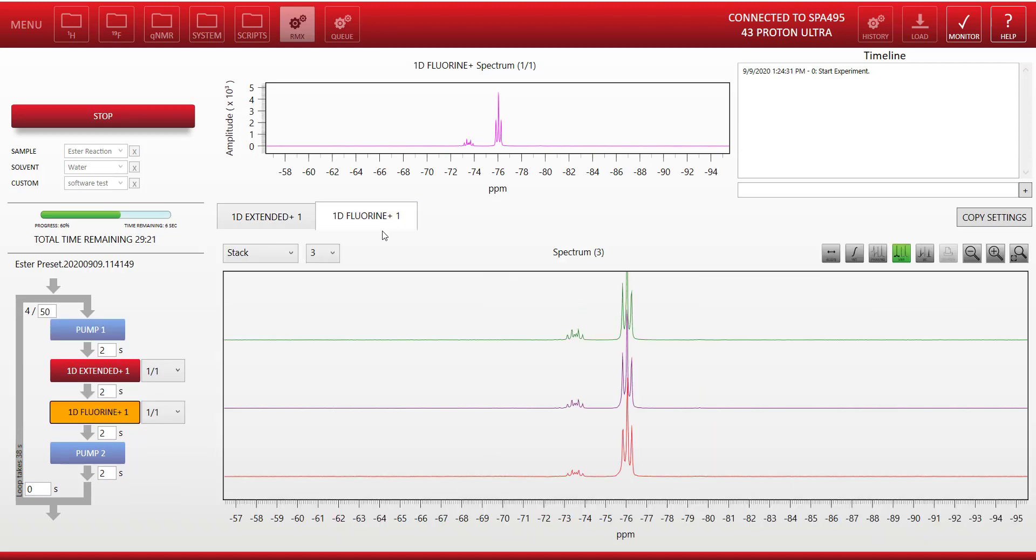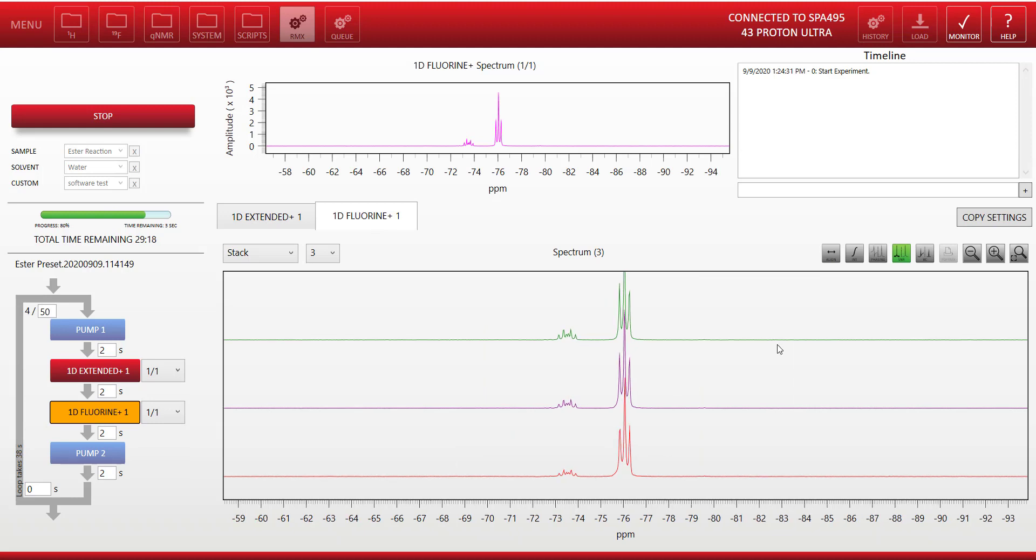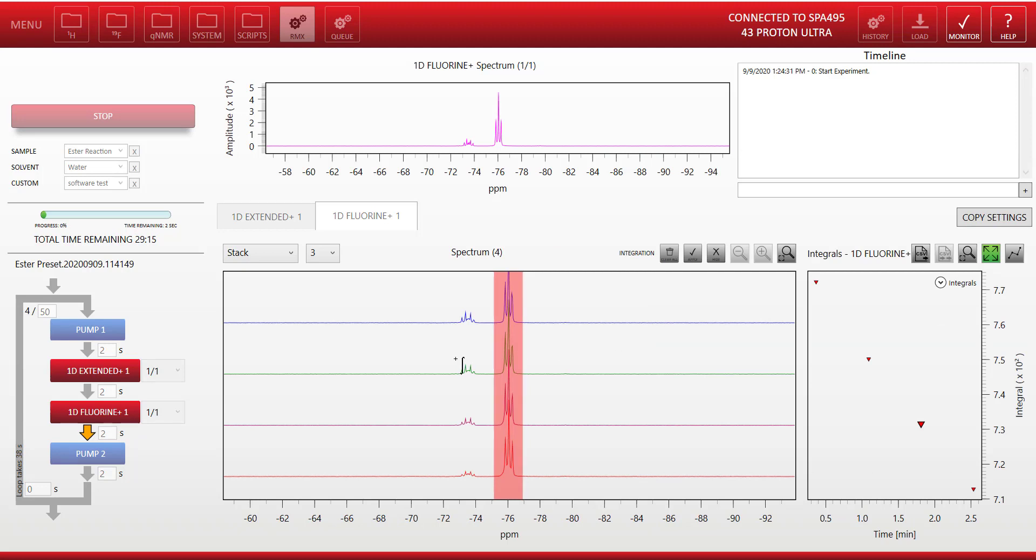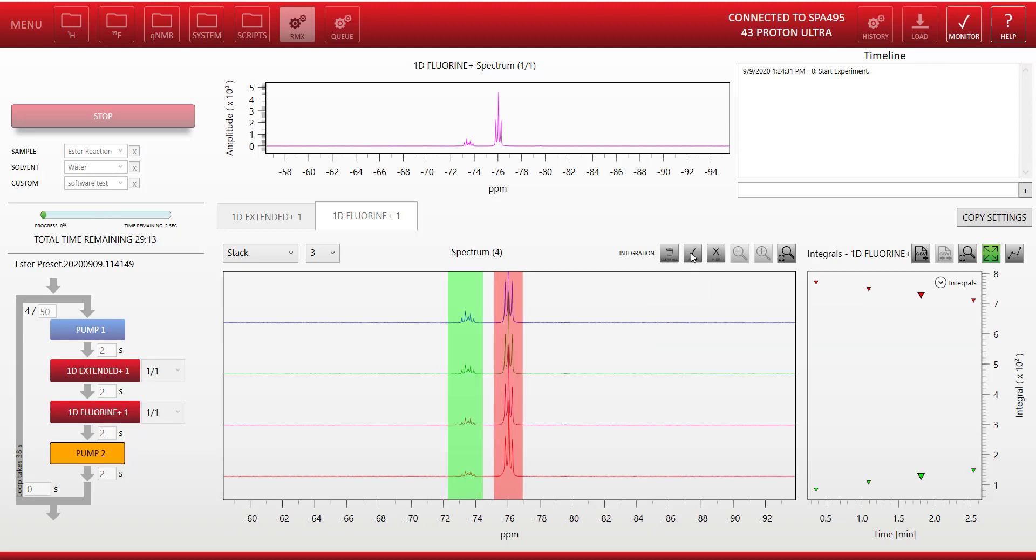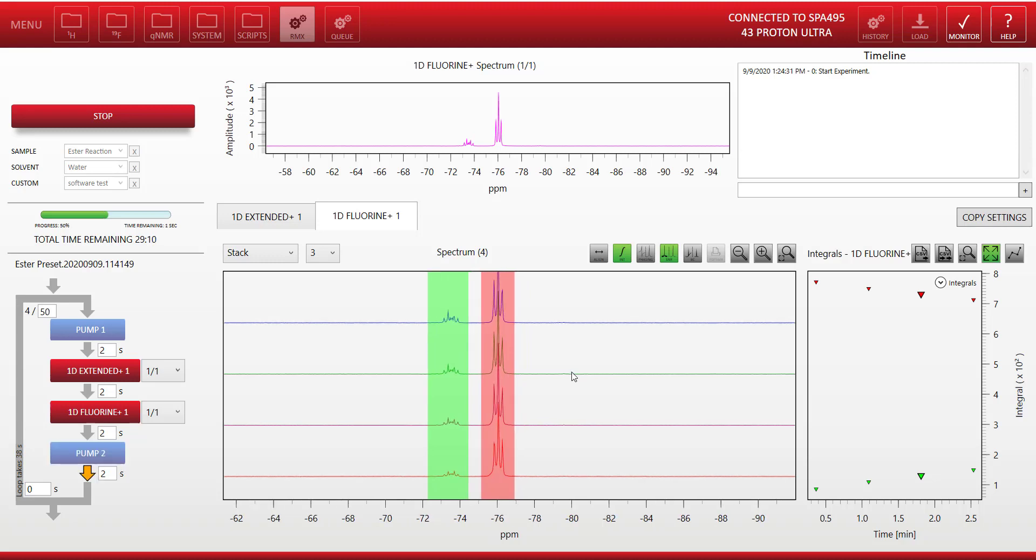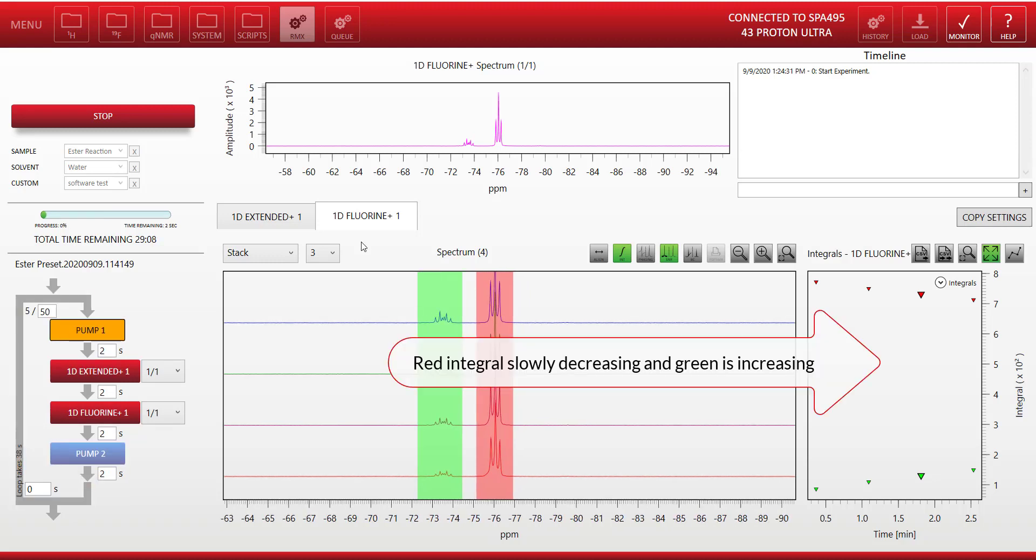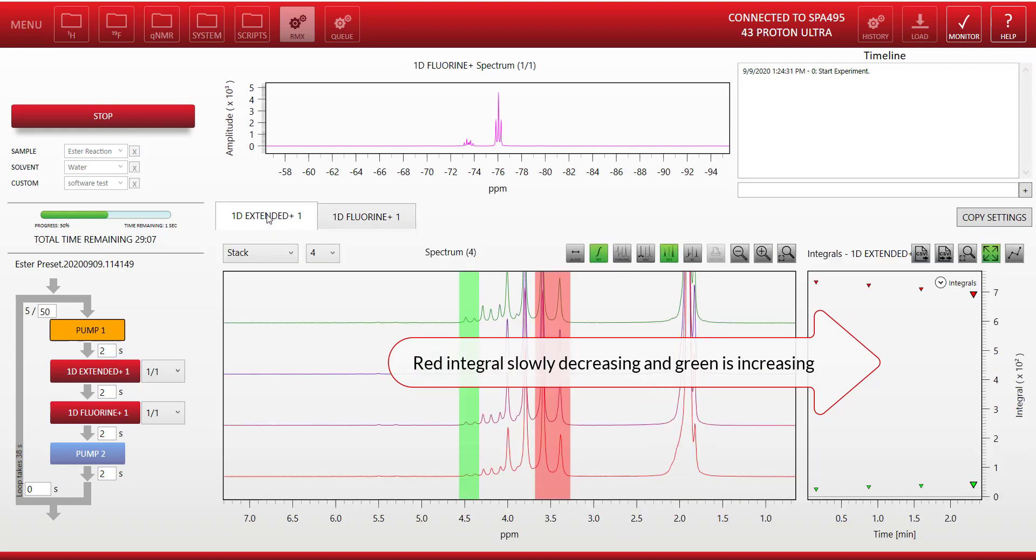Now let's jump to the fluorine data, and we can do the same thing again. Set up some integral regions, one for the area on the right and one for the area on the left. And you can see on the right hand side we do have the peak. The red region integral region is slowly decreasing, and the green region is increasing.